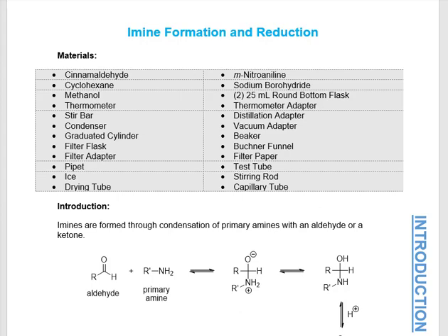Organic Chemistry 2 Lab. The experiment today will focus on the formation and reduction of an imine.